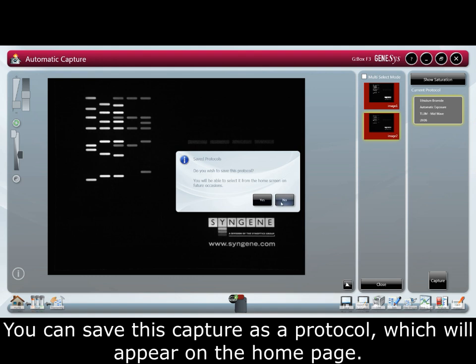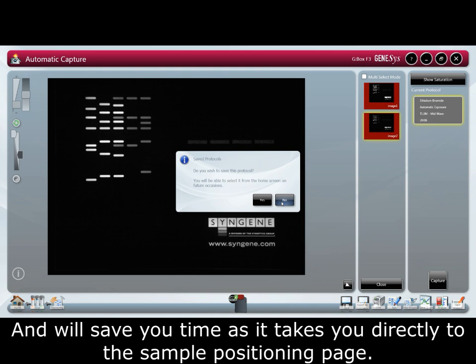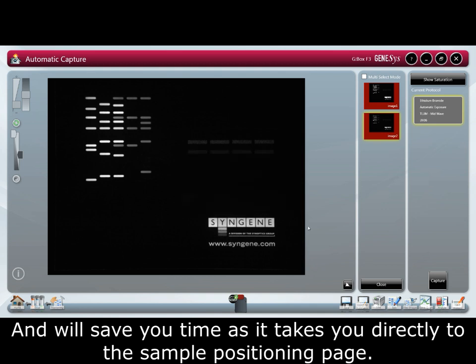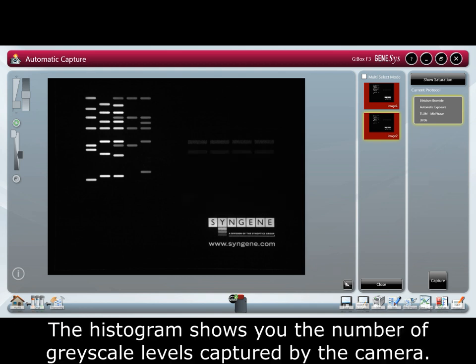You can save this capture as a protocol, which will appear on the home page and will save you time as it takes you directly to the sample positioning page. The histogram shows you the number of grayscale levels captured by the camera.